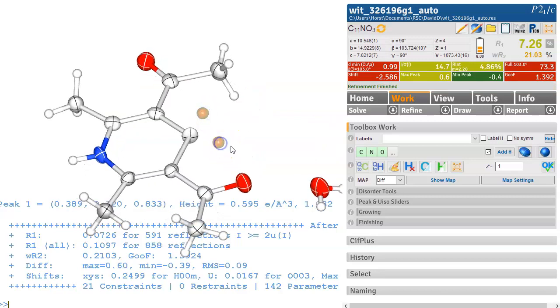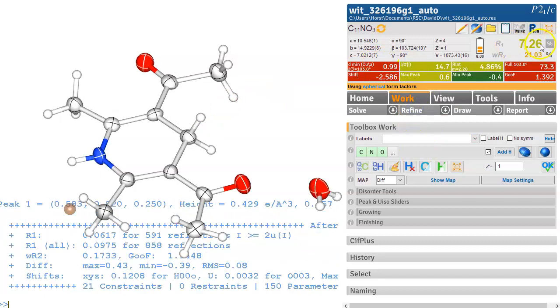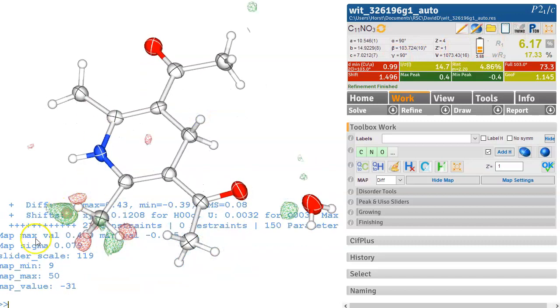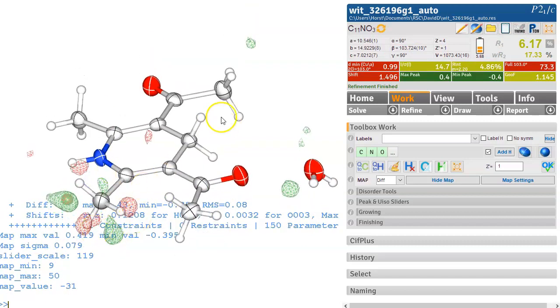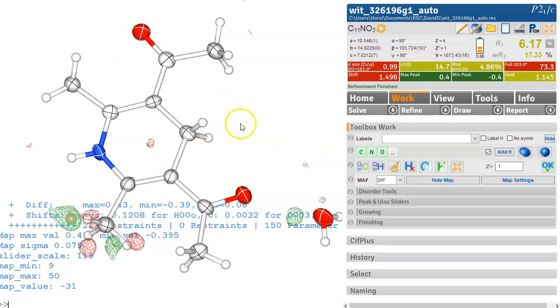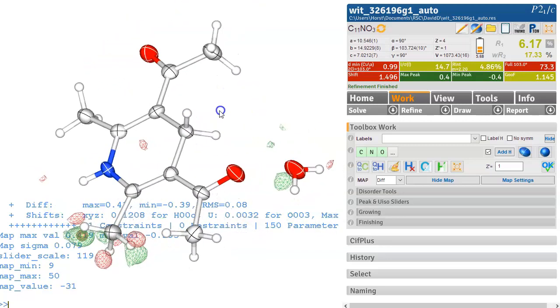You can just select those and make them a hydrogen so we type name H so we make them into hydrogen and refine this. There are vectors 7.26 down to 6.17 so they're definitely real and Ctrl M now there's something wrong where these hydrogens are but these ones are looking quite good so there's no doubt that this is a CH2 over here.